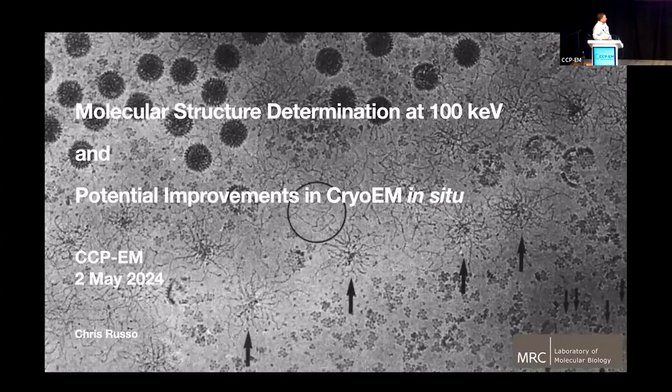Right, so I often like to start with this micrograph. It's one of my favorite micrographs of all time, from Jacques Dubochet, more than 30 years ago, of adenovirus. It's an extraordinarily beautiful image. In fact, it ultimately became used for the icon of EMBL, that little symmetric thing with the green dots and whatnot. It's actually meant to represent one of these images.